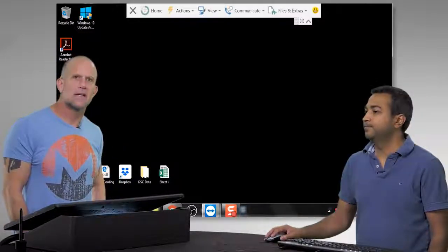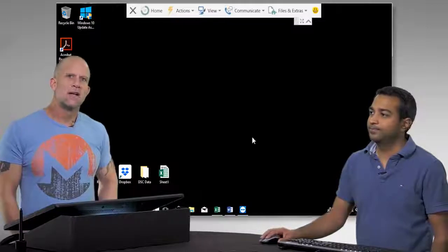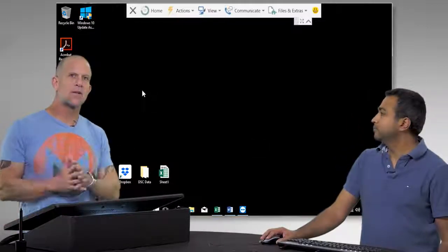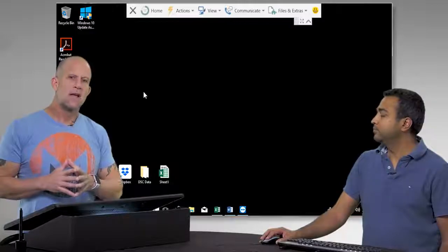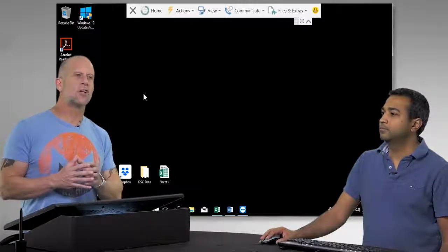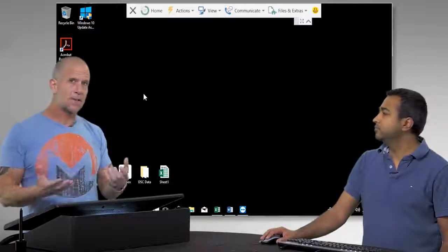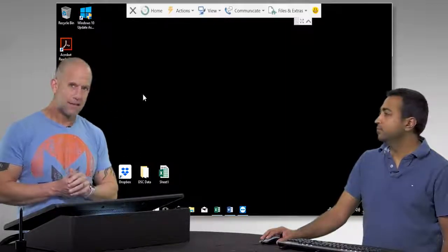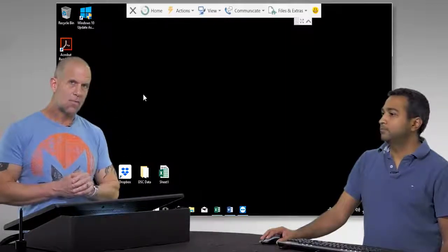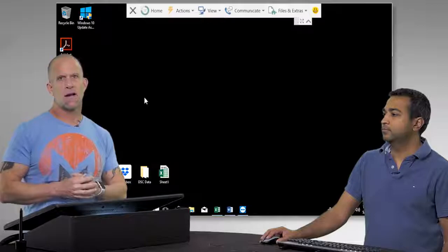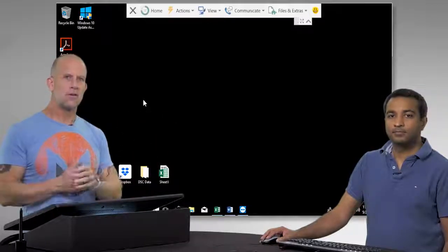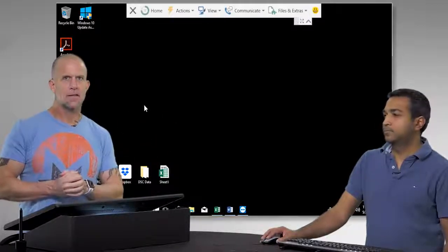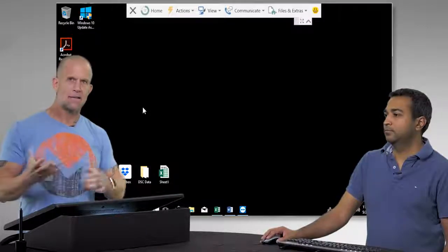We're making this video today to introduce the TA Instruments DSC 2500, Discovery 2500, and what you would do to generally set up an experiment, run the experiment, and be able to collect the data. We'll make future videos on how to analyze this data and do advanced processing and thermodynamic analysis of it.